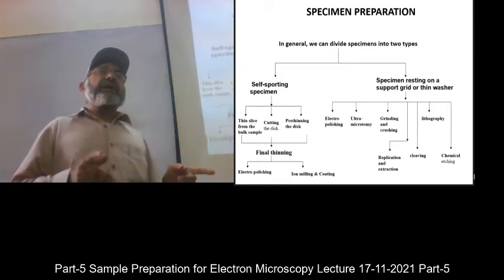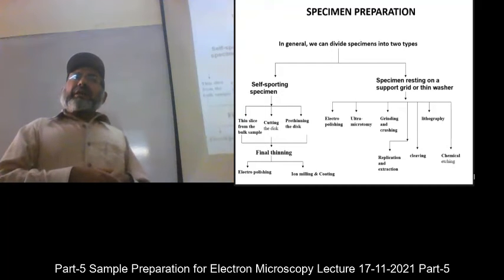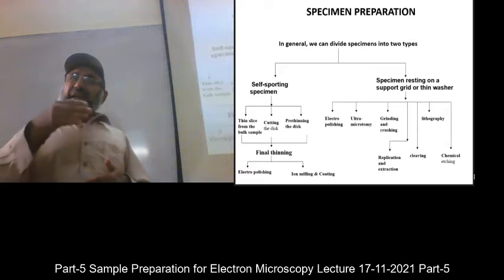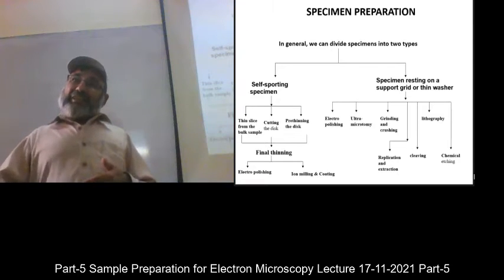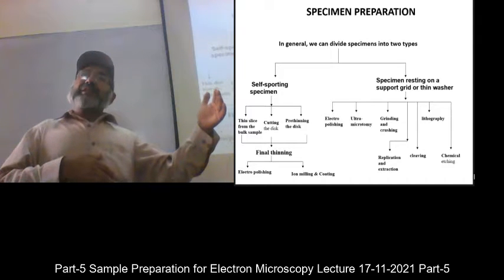And that is why people sequentially study the transformation of phases with temperature and take a sample at each step, to see what is happening to the material with temperature.